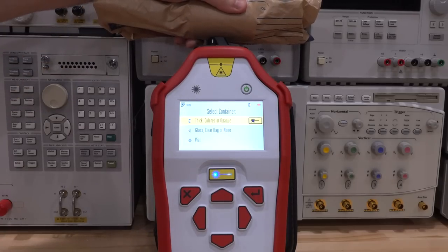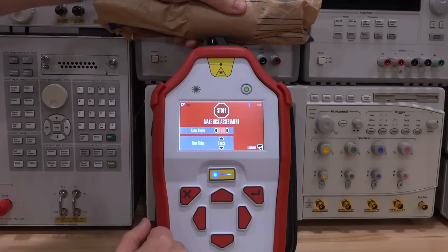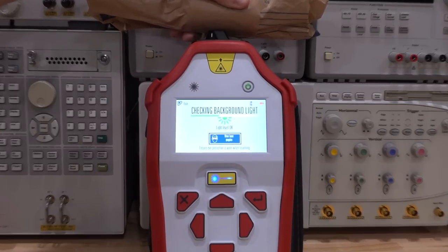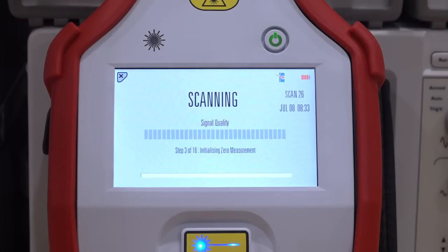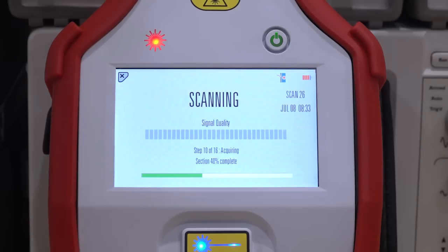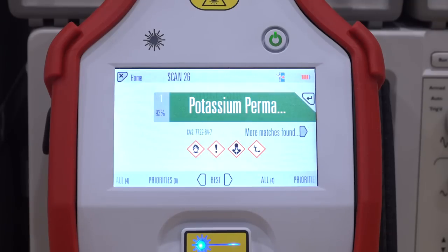So let's take this and scan it with our Agilent Raman Resolve and see what happens. I'm going to hold the sample here directly on top of the nose cone in the front of the instrument. We're going to select the thick, colored or opaque sample option, because this fits that criteria. We select our laser power, and then we wait. It's going to take about a minute for the instrument to do the scan. First it's going to check for ambient light, then do some initial measurement, and then several different steps until it comes to the analysis.